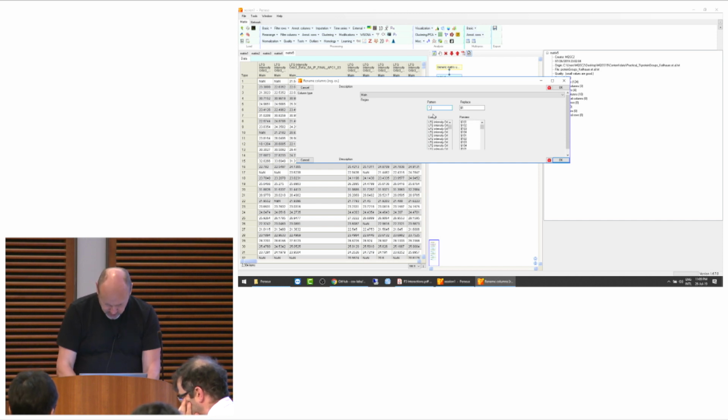And that you do by dot star, and now final, underscore, and now you want the thing that you want to keep. That's always in parentheses, dot star.